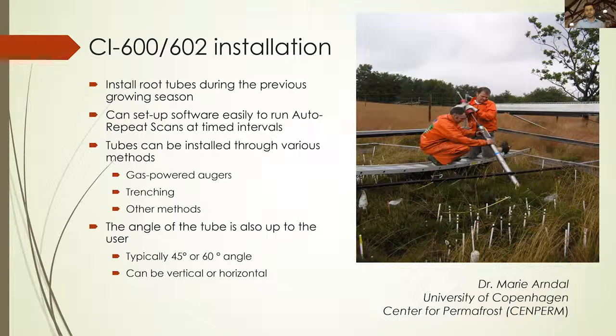Now, in this picture from the University of Copenhagen, you can tell that they're inserting the 600 into a tube that's been covered in, it looks like, duct tape, just to make sure that UV light does not get in for their study. But what you can also do, if you wanted to do a single location and just scan over a long amount of time, is tell the software to do repeated scans, either every 5 minutes, 15 minutes, up to 12 hours. So once you put that in, the scanner will just sit there, and every, say, 5 minutes, it would make a scan of the roots, and do so again for 12 hours. You can do this as long as it's plugged into a computer, and the computer has power.